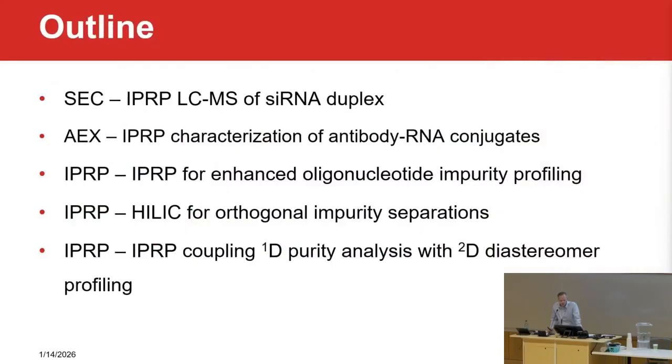So my talk will focus on a number of different 2DLC implementations that we've done at Lilly to help guide process development and improve our impurity characterization of different siRNA drug substance and drug products. This includes size exclusion, anion exchange, ion pair reverse phase or IPRP, and hydrophilic interaction LC or HILIC.